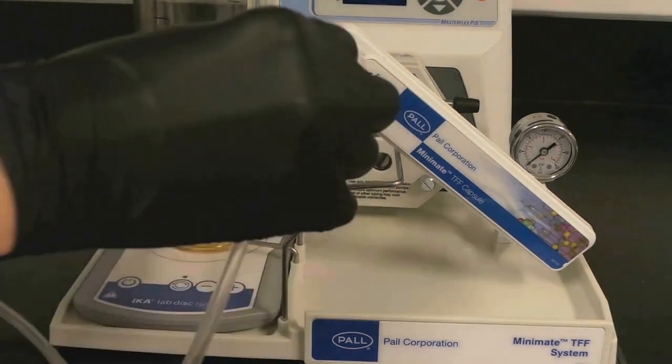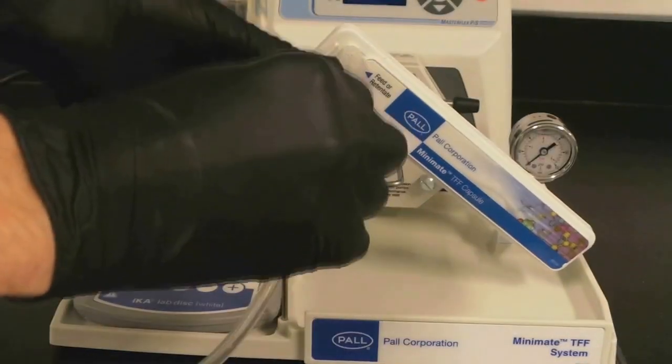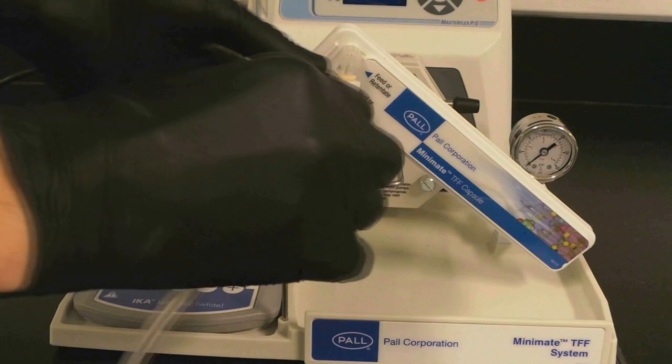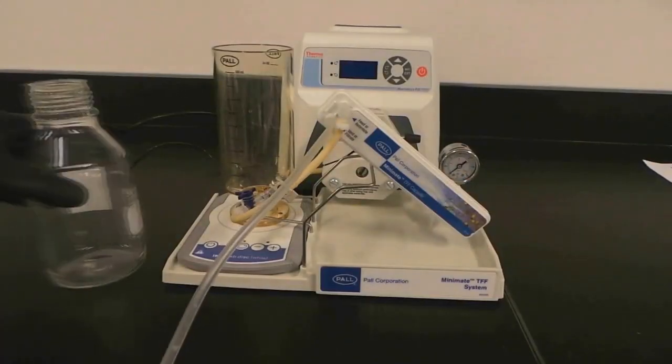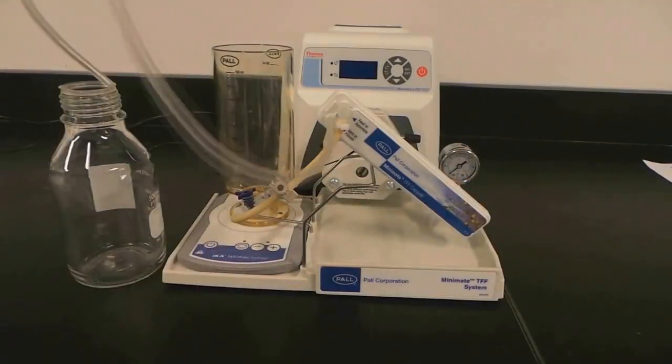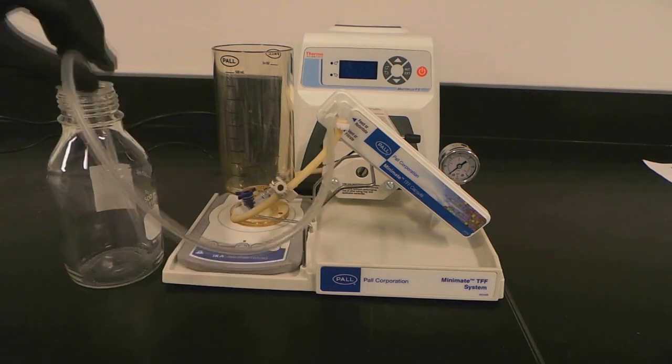Complete the initial tubing installation by attaching the long, clear tubing to the filtrate port. Finally, place the tubing into a flask, and your MiniMate system is now ready to run.